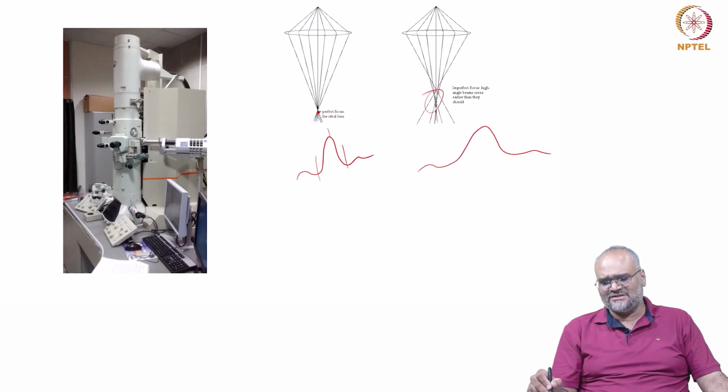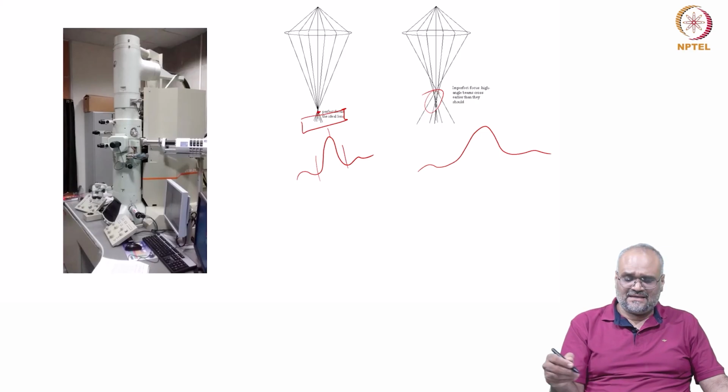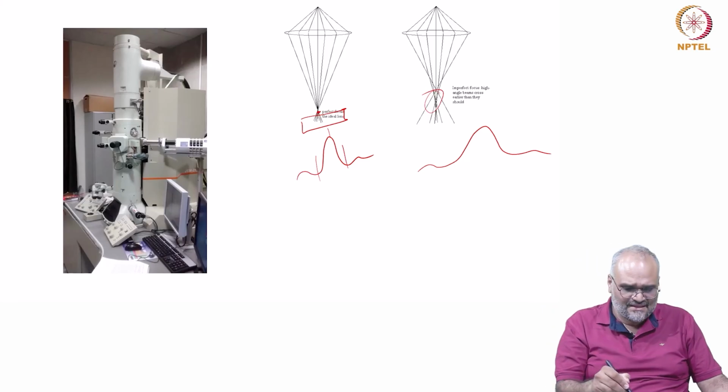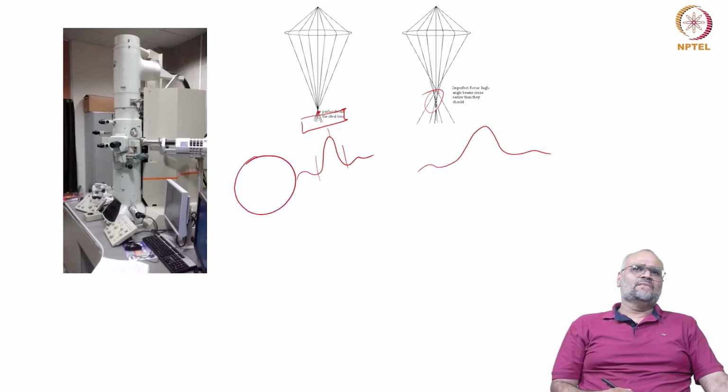And if I take a projection of this, I can actually look at how the projection looks. So in an ideal scenario, when this is impinging on my specimen, at the back focal plane or at the Fourier plane of this, I would see a disc kind of pattern.